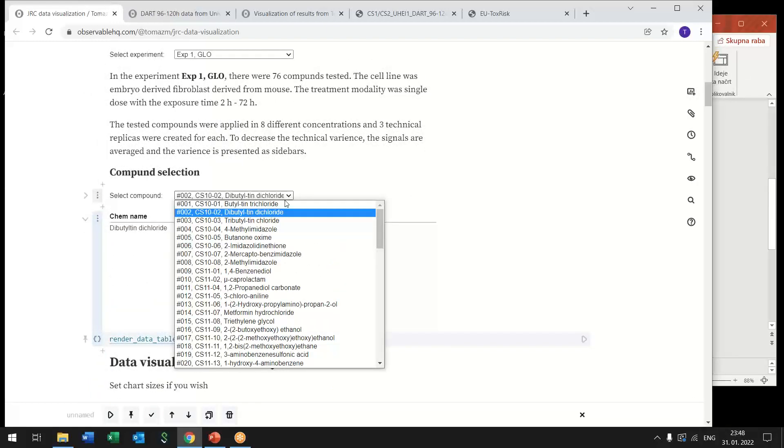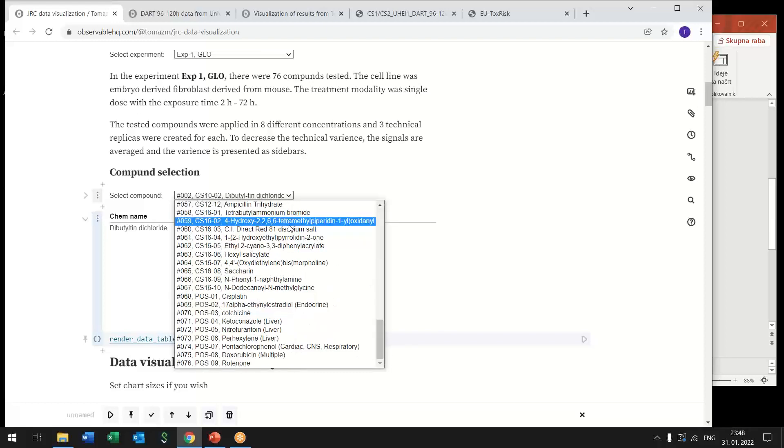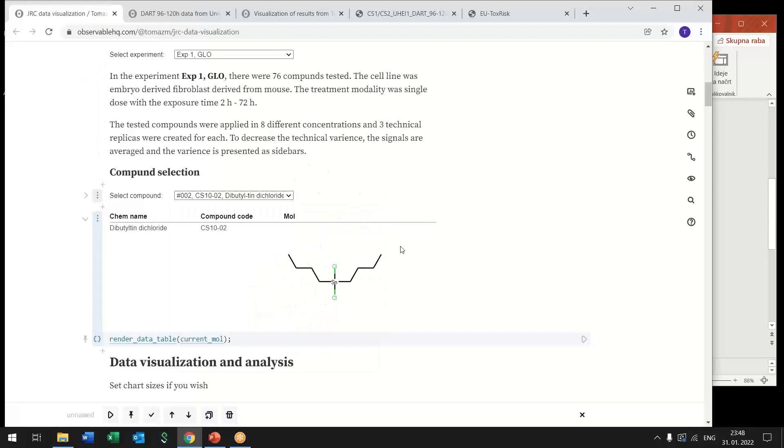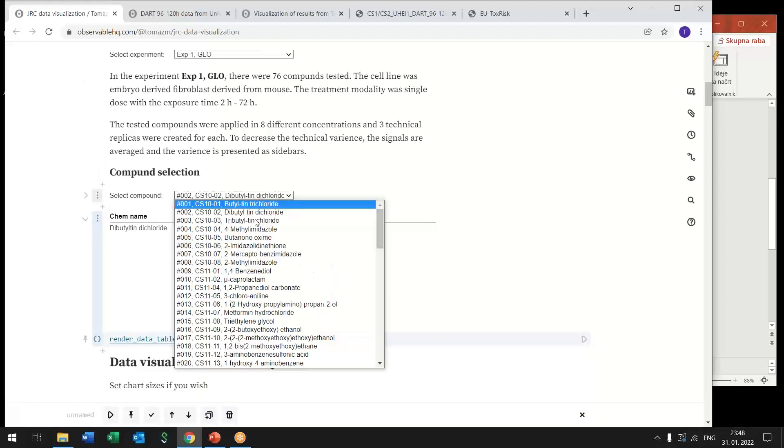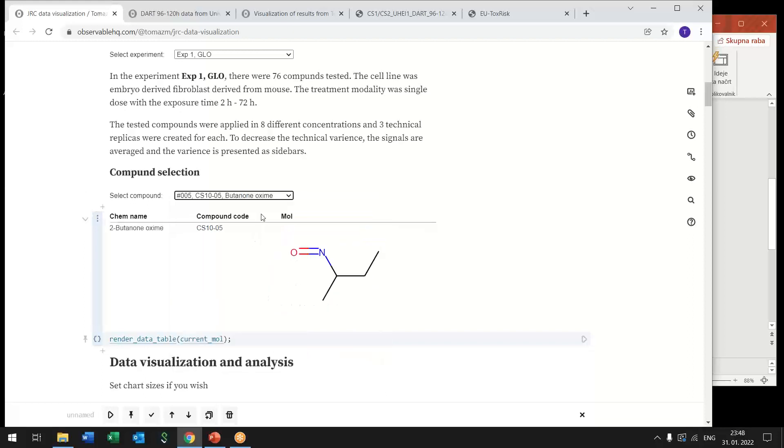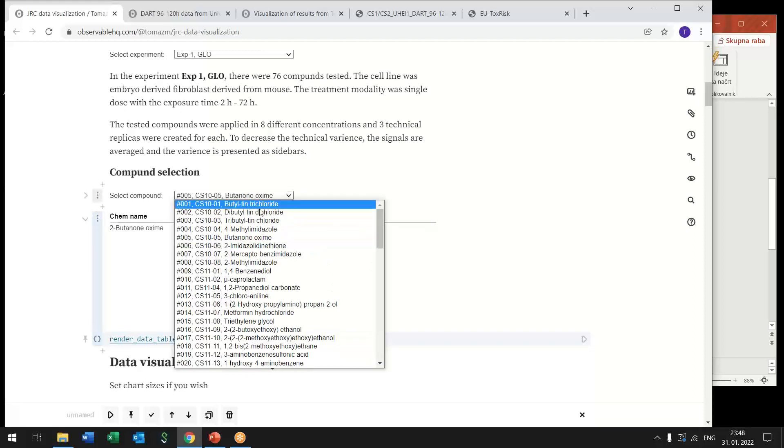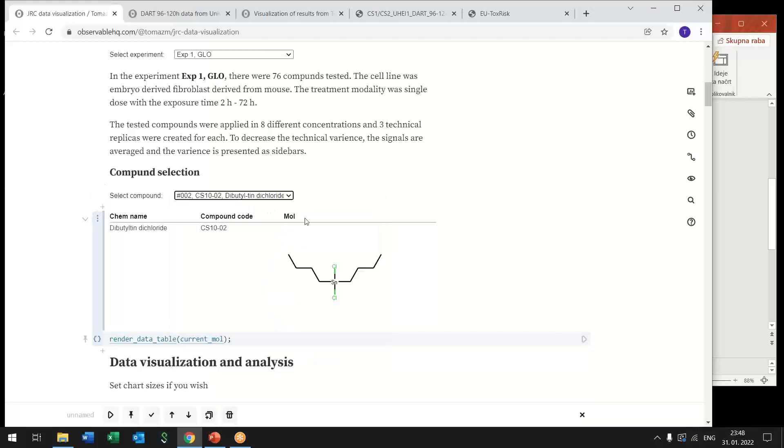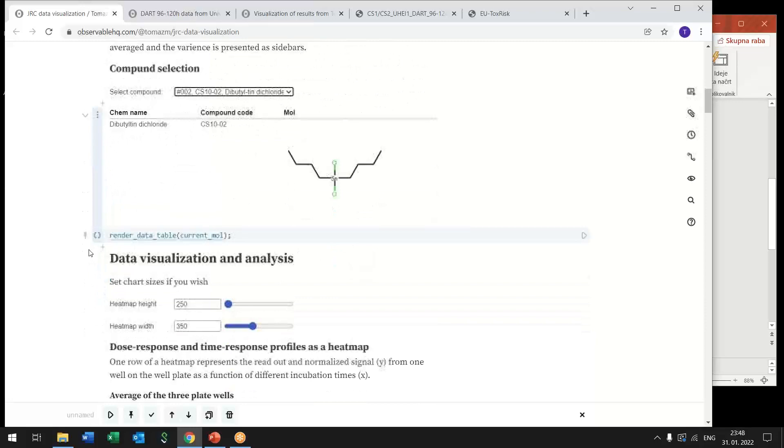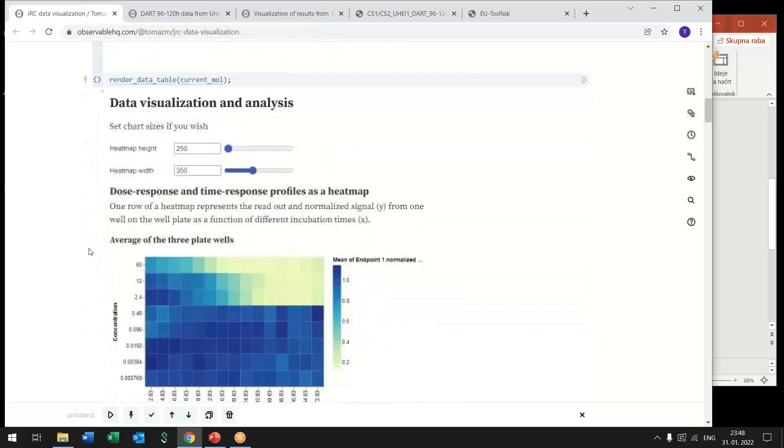And next in the next stage you can also select a compound from a list of compounds that were tested in that experiment. And immediately when you select a compound you get the structure of that compound displayed here so that you have some idea about the structure of that compound.